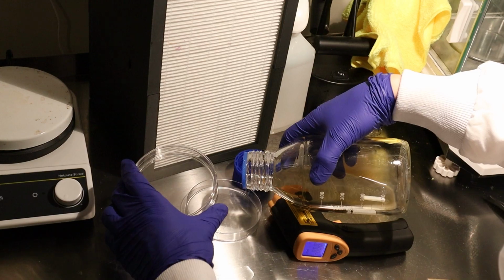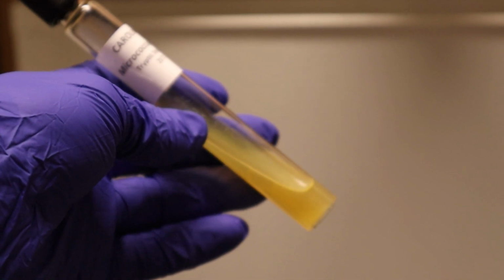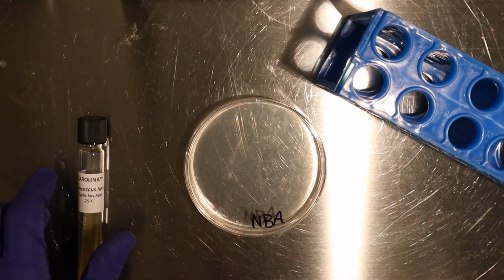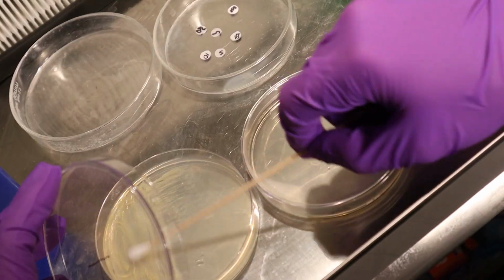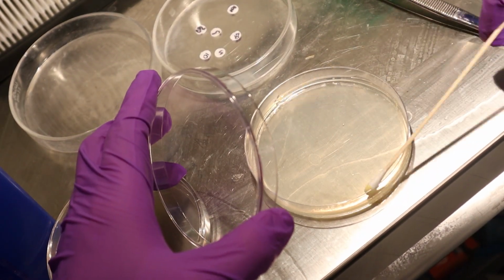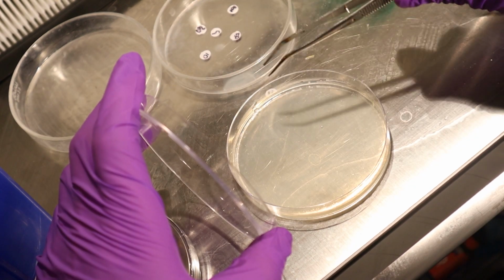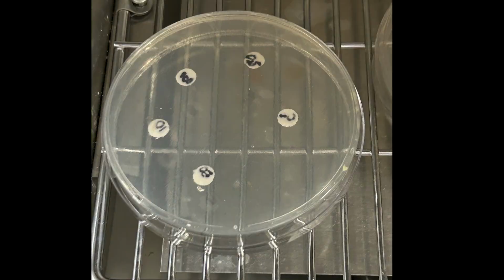I now needed to streak a lawn of susceptible bacteria to the antibiotic to place the discs on, which someone on the Reddit post suggested using Micrococcus luteus, as it was supposedly very susceptible to the antibiotic. I had bought some beforehand and streaked a lawn of it on some nutrient agar while the Streptomyces were still incubating. To make the disc diffusion assay, I took my plate of Micrococcus luteus and streaked a lawn of it on a plate of standard method or tryptone glucose extract agar, which was the agar I was using to grow it. I then flame sterilized some tweezers, and once cool, I carefully placed each disc onto the Micrococcus luteus lawn, and put it away to incubate at 30°C.